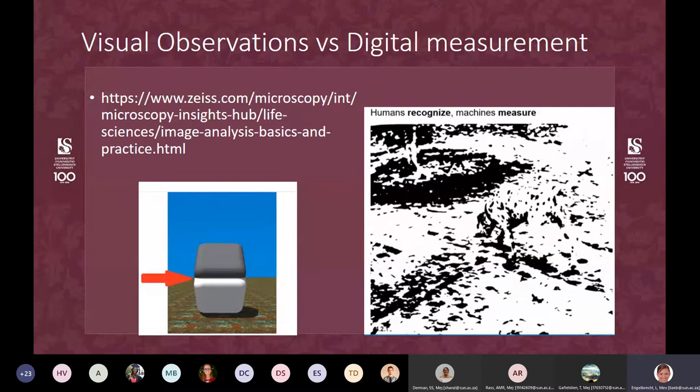But two of the things that I borrowed from the video, the one was this image on the left-hand side with the block. It looks to us like there's a dark block at the top and a light block at the bottom, right? Probably very dark gray at the top and a whitish block at the bottom that's a bit in the shadow. But what was very interesting in the video, they said if you put your finger right in front of the area here, you would actually see that the color at the top and the color at the bottom is exactly the same. That just shows you that our interpretation of images is not always reliable. We think there's dark at the top and white at the bottom, but in all truth, if you measure those colors, they are exactly the same. Hence the reason why it would be good to look at your images not just with your eyes, but actually doing some digital processing and measurements with software.